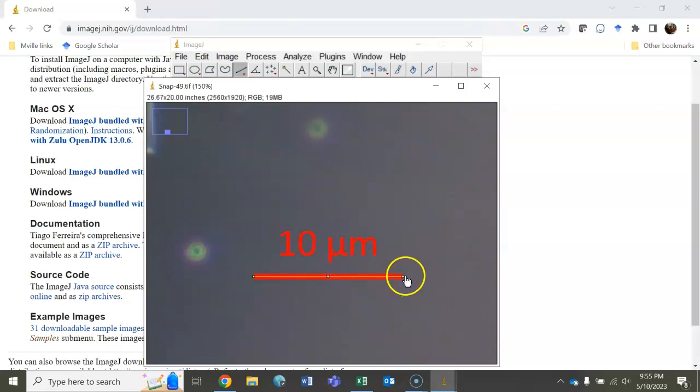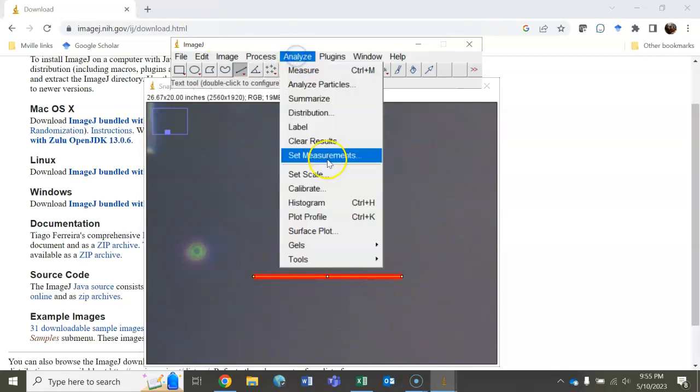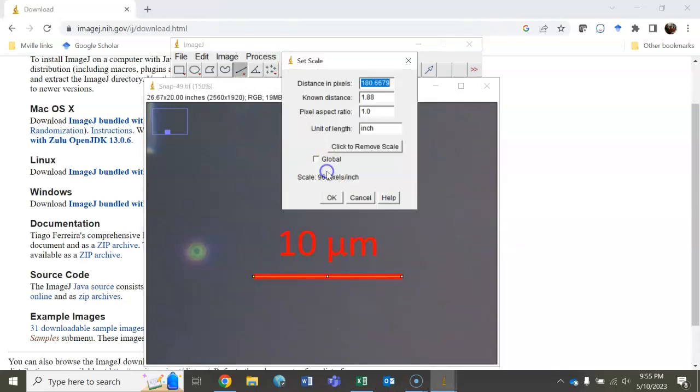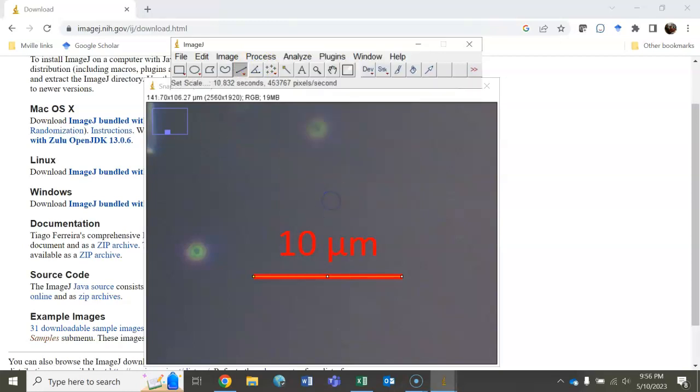Looks pretty good. You can adjust it if you want a little bit. Now that we have it the exact length of the scale bar, go to Analyze, click Set Scale. In this case, we can see our unit of length is micrometers. We're going to put that in there. Our known distance in this case is 10 micrometers. Click OK, and our scale is now set.